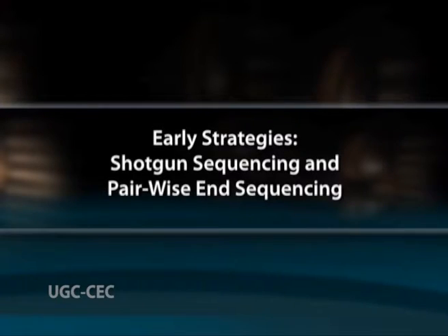Early strategies: shotgun sequencing and pairwise end sequencing. In the shotgun sequencing method, several copies of a DNA fragment are cut randomly into many smaller pieces. All of the segments are then sequenced using the chain sequencing method. The fragments are then analyzed with the help of a computer to see where their sequences overlap.